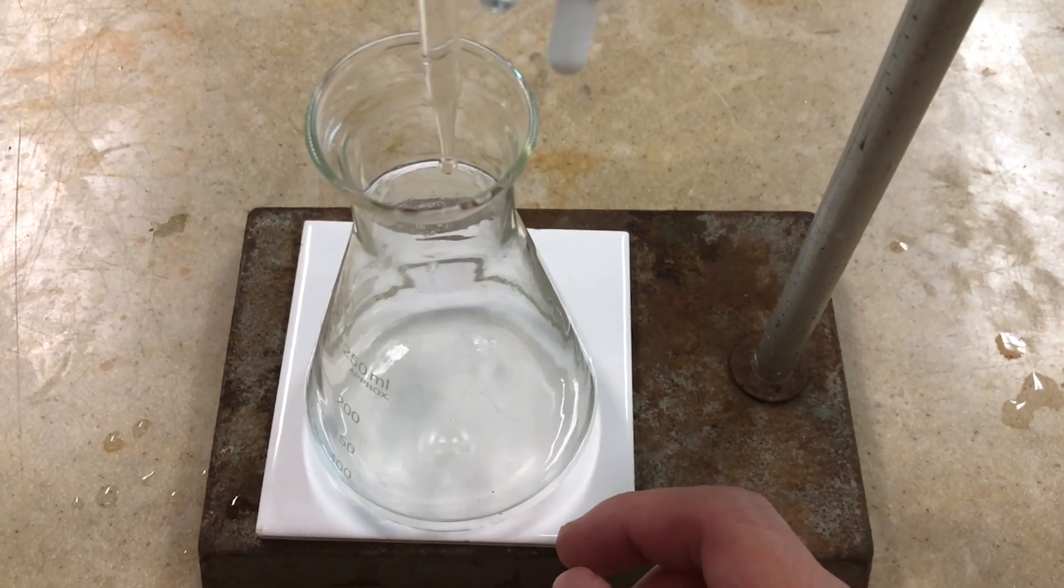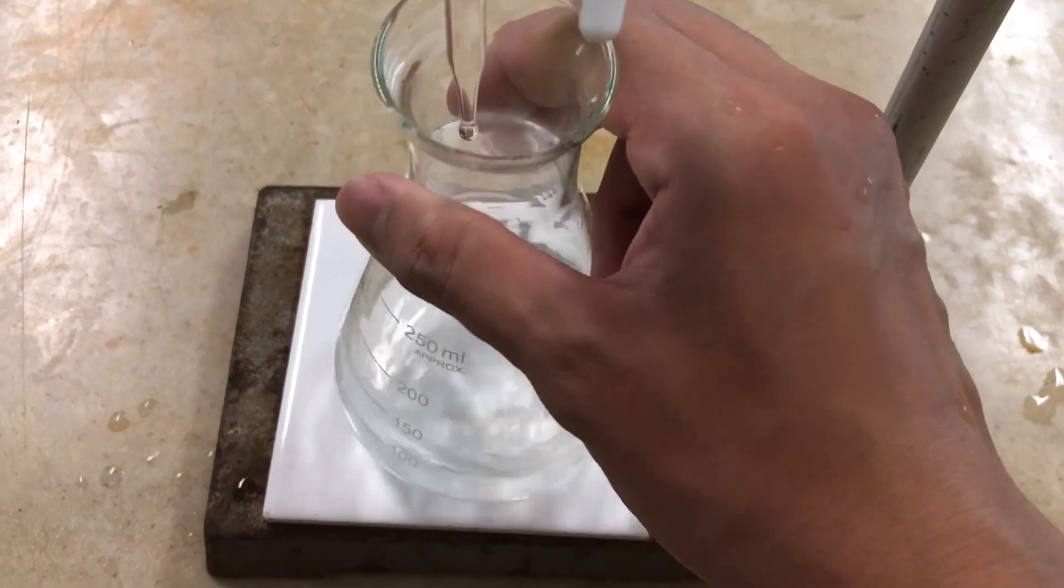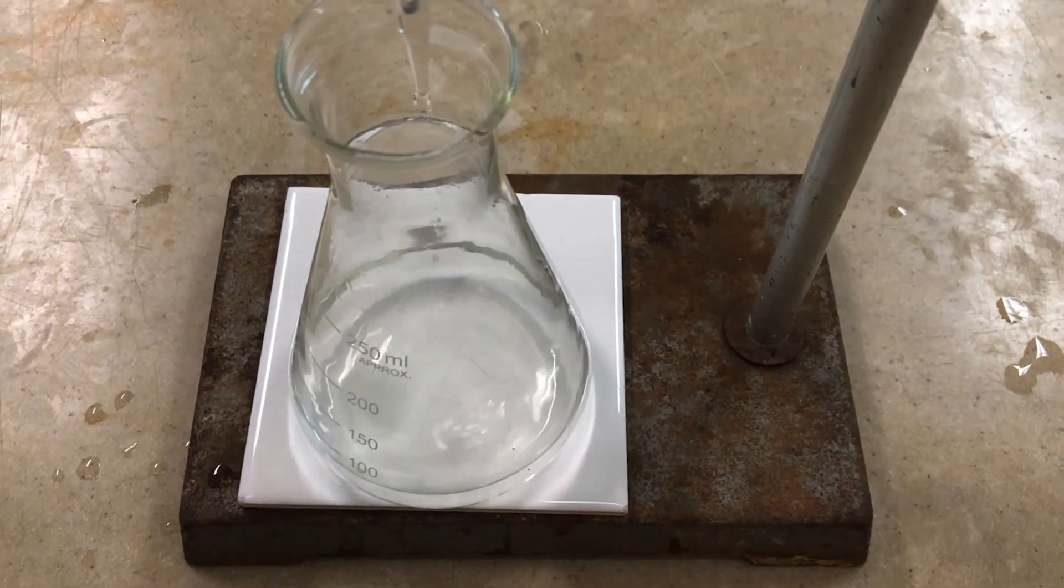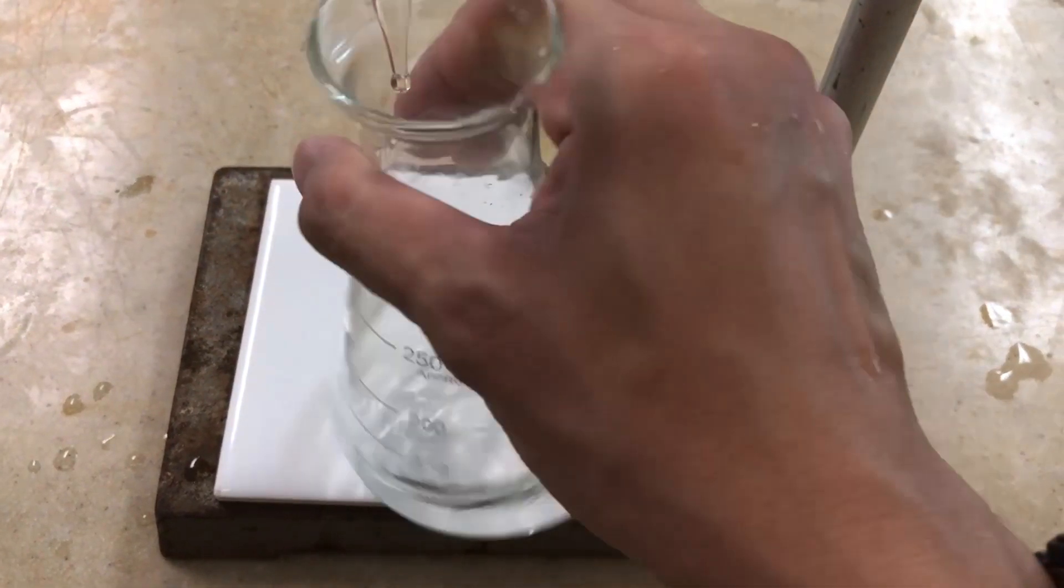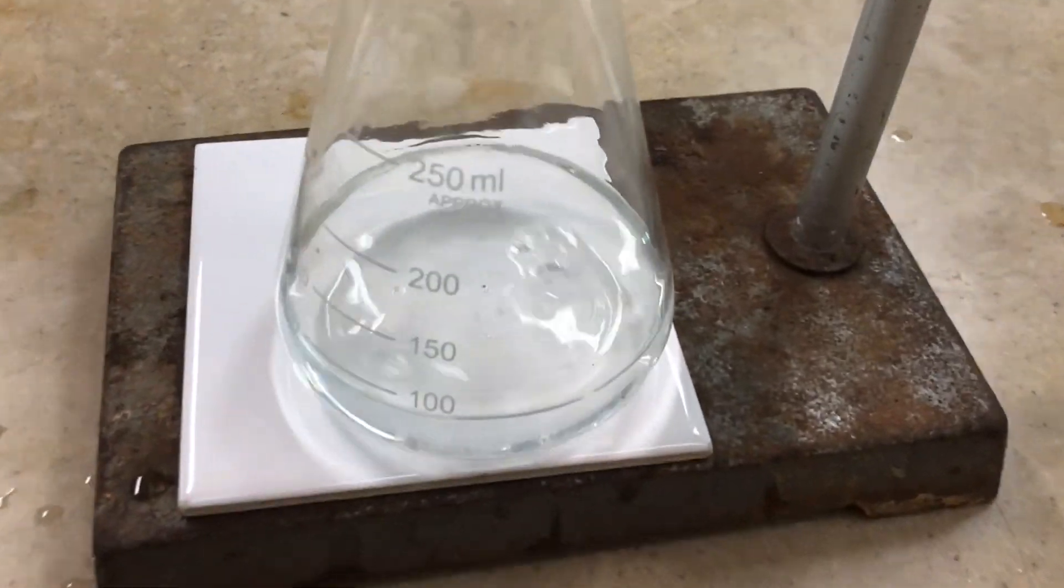As you continue with your titration, you start to realize that there might be a color change that seems to appear, but once you swirl it, it will start to disappear. This means that we are very close to the end point. At this point in time, you should be adding in dropwise.